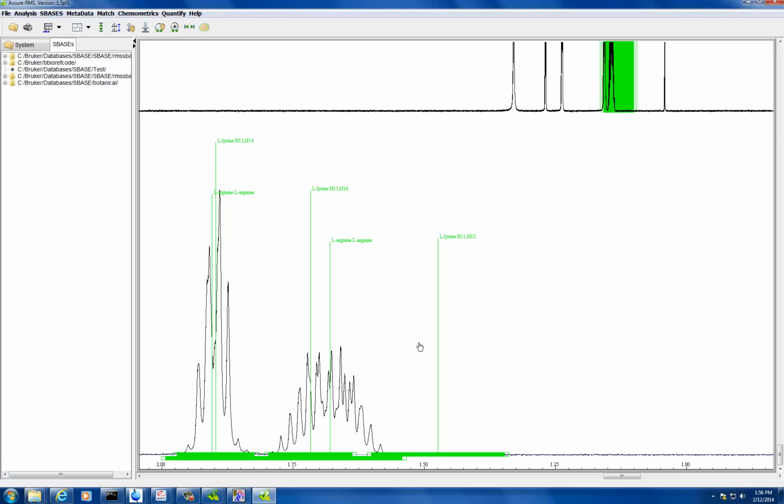When do you need to quantify one area and when do you quantify more than one area? Technically, one area would instantly tell you the quantification already. The reason why sometimes you quantify more than one area is just to see how close the numbers are to each other. For my compound, I have a question.